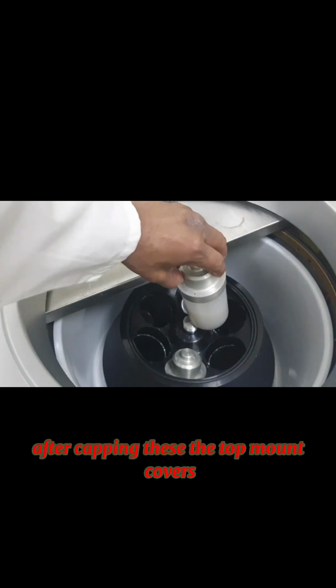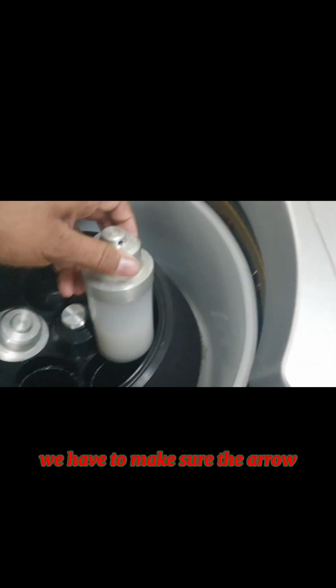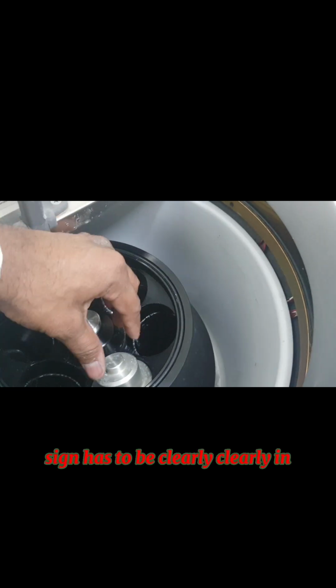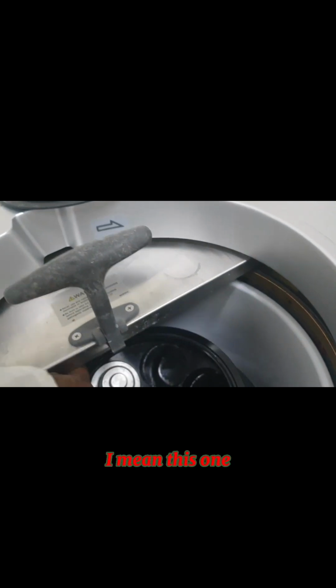After capping the top mount covers, we have to make sure the arrow sign is clearly in line with this one.